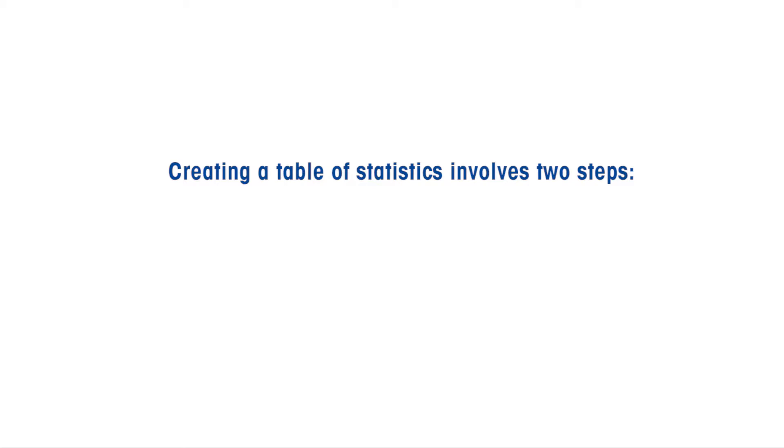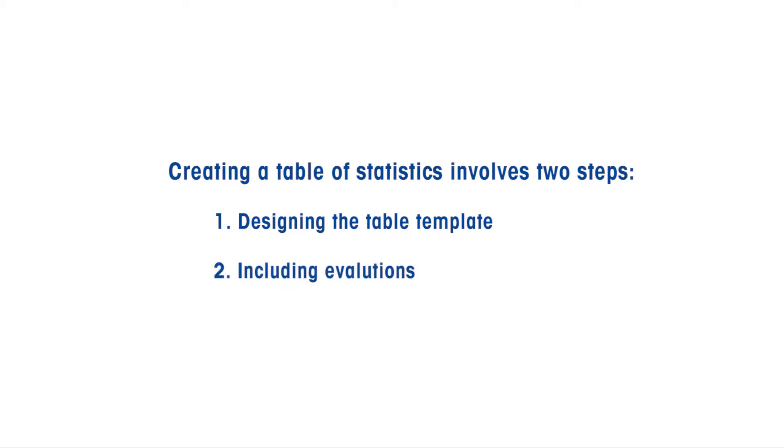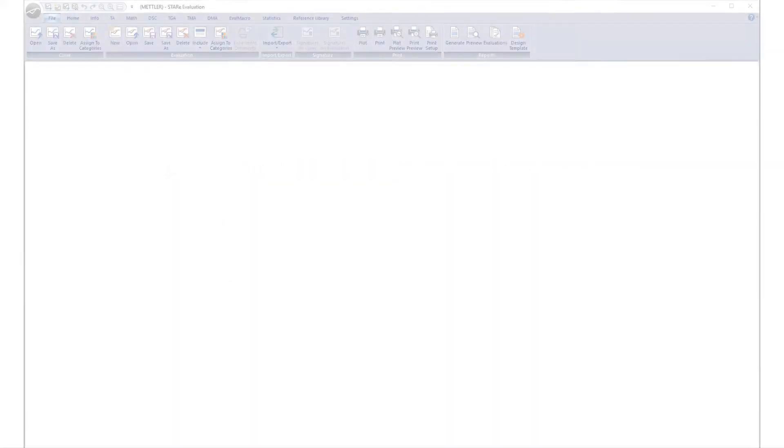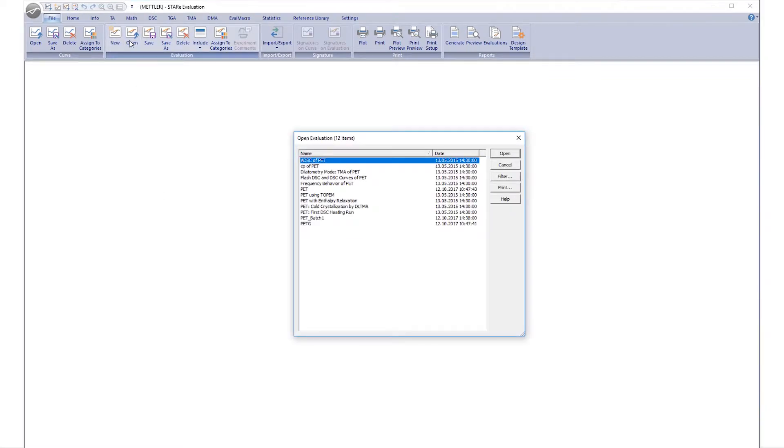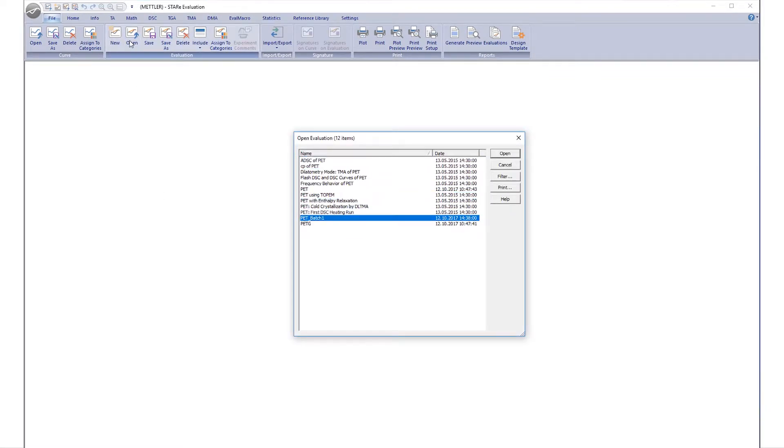This involves two steps: designing the table template, including evaluations. Once correctly set up, the current measurement and its results are automatically transferred to the statistics table. Start off by creating a template to define which results are to be included in the table. Open the evaluation of polyethylene terephthalate in the evaluation window.